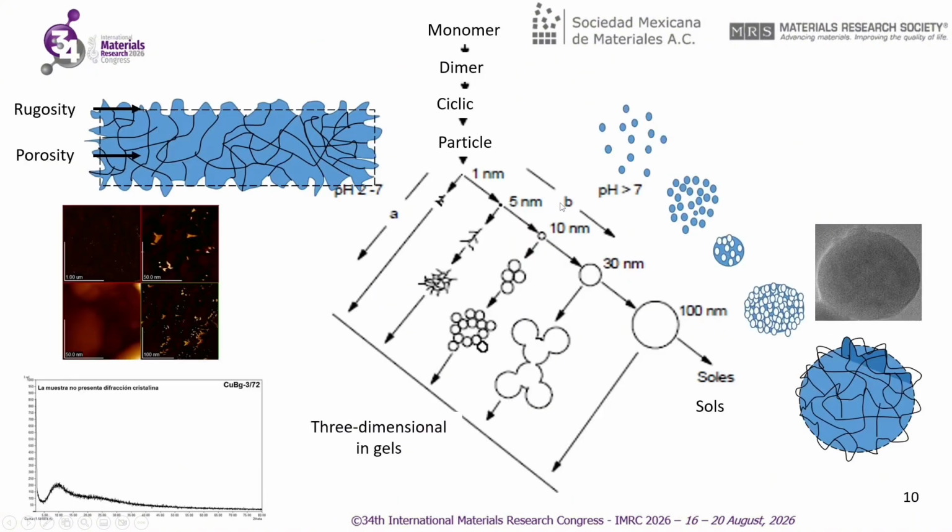In summary, using bioglass particles obtained by casting and subsequent sieving is ruled out. For particles to be introduced in said polymer nanofiber matrices, it is recommended to use particles obtained by the sol-gel process via either acid catalysis or base catalysis. However, in the first route, the average agglomerate particle size is on the order of 600 nanometers, whereas in the second route, basic catalysis particles have a diameter of 100 nanometers.